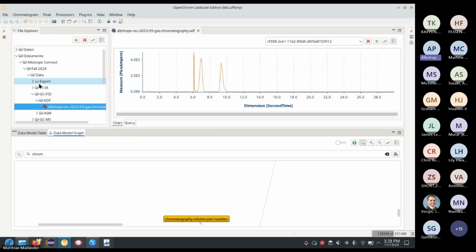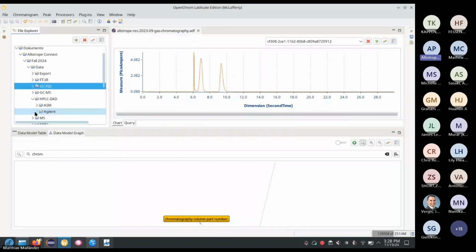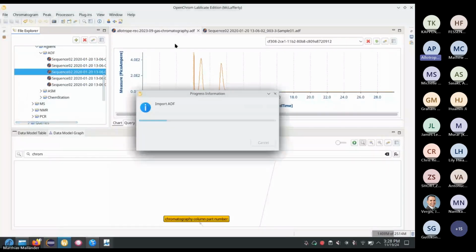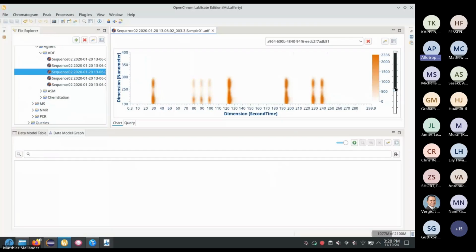And actually, I want to show you also the 2D data. Look at the cool example files. These files really help development a lot. So again, huge shout out. You can also look at 2D data, and this is the data range, like the bar on the right that you see. I can change this a bit to make it sharper and to adjust the image a bit. So this is just exploring the data.